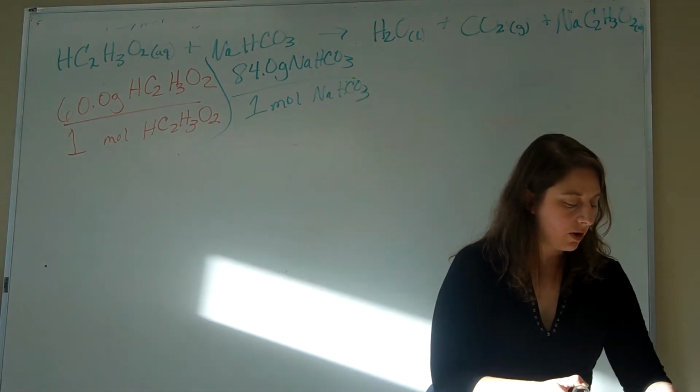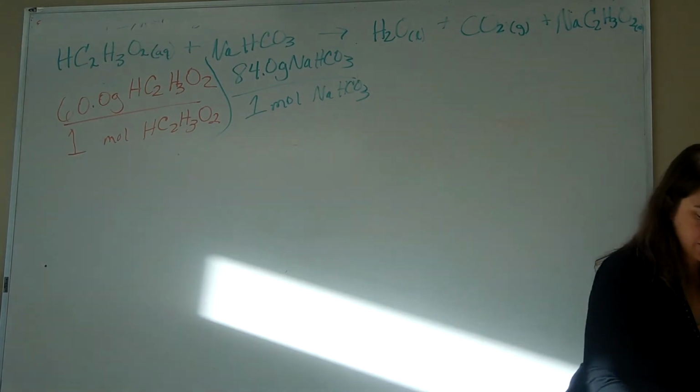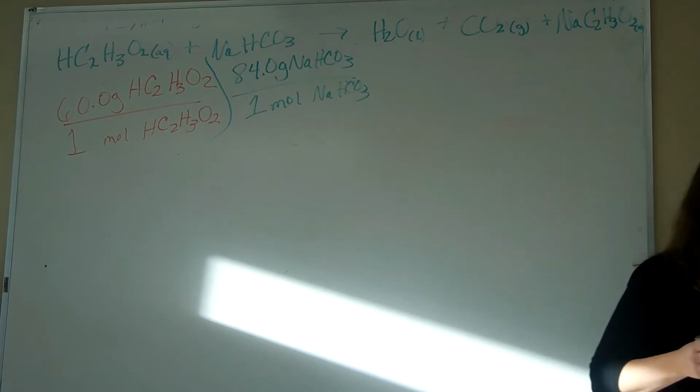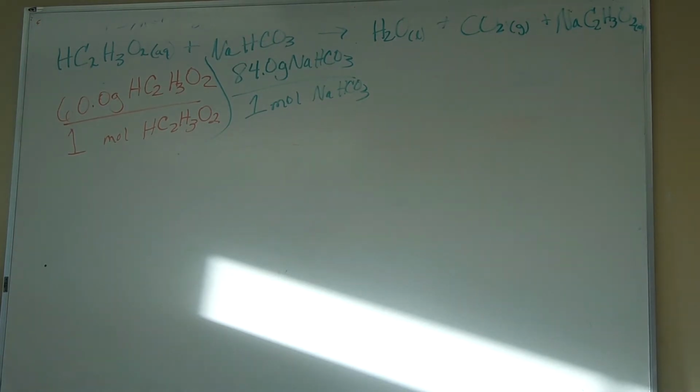And then we're all going to type it into our calculator, because since we're using 40 milliliters instead of 25, I don't have the answer. So we're going to make sure that we don't make a mistake. Also, every lab group is going to need a graduated cylinder with 40.0 milliliters.